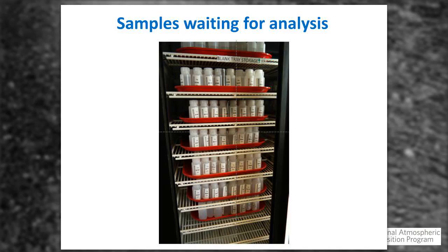We really use all that sample volume because we have to pre-rinse the filters for the samples. Should there be occasional spillage in the lab, we can go back to the original bottle if there was some issue in the filtration. We have had inquiries where people are trying to get away from that extra ounce of shipping. I realize everyone's budgets are tight, but limiting the amount of sample volume that you send to the lab doesn't really benefit the program as a whole because samples can leak. You go to all that effort to collect that weekly sample. We really need as much as you can to ship to us.